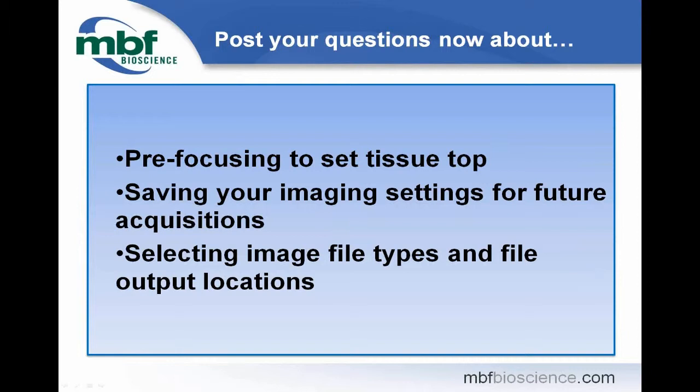There's a question regarding acquiring multiple channel images without a motorized filter on a microscope. For those users that don't have a fully motorized microscopy system, our software is designed to work with this situation. What we do is we set up a series of device command sequences which simply prompt the user to engage the correct filter. Whereas the system I'm using now simply drives the microscope to make the movements and filter changes, what you would experience is a message telling you, now please move to this filter, or now please move to this other filter. Essentially, it can still be done, except it's done in a much more manual fashion.